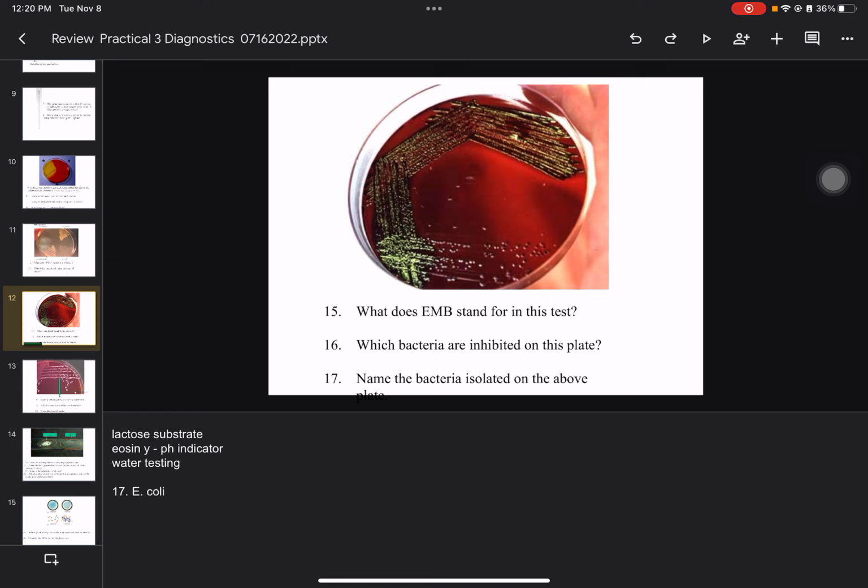Okay, what's the last column there? Is that GP? What is that? Group. Oh, group. Okay, so this is what's most confusing to me. One resource says identify group D Streptococcus. Okay, listen. Don't look at that. Only look at that. That says group, G-R-O-U-P.